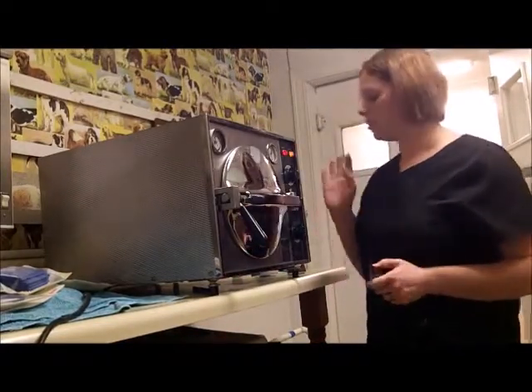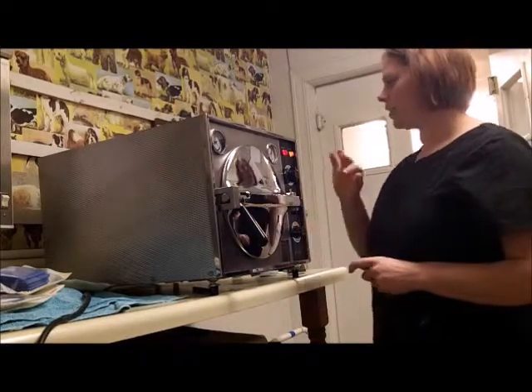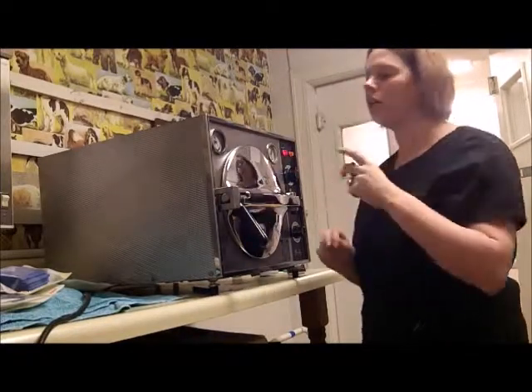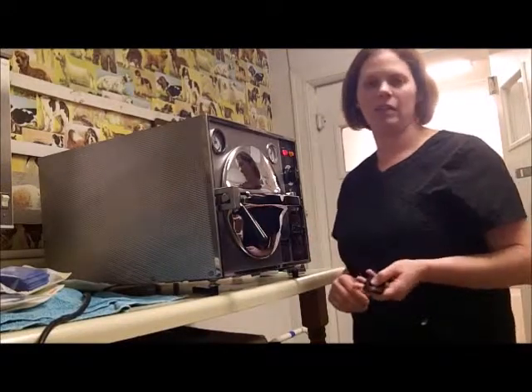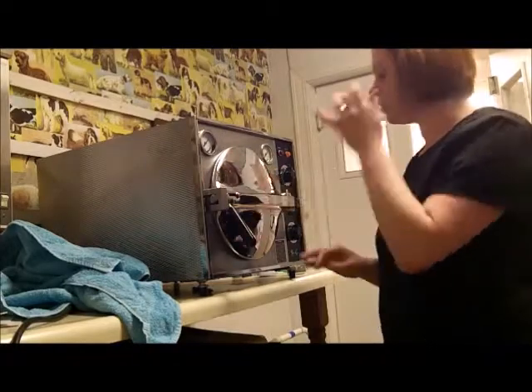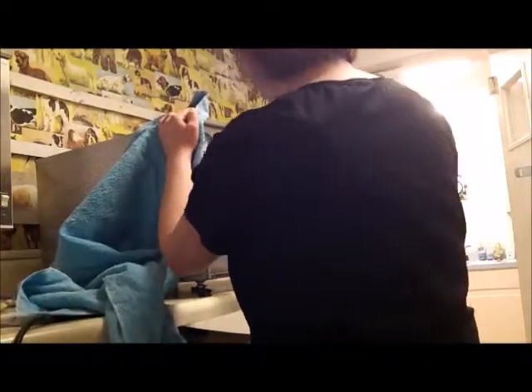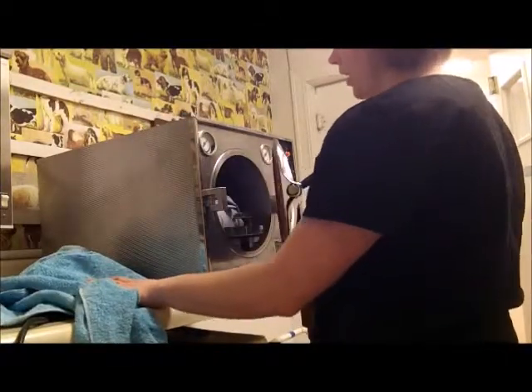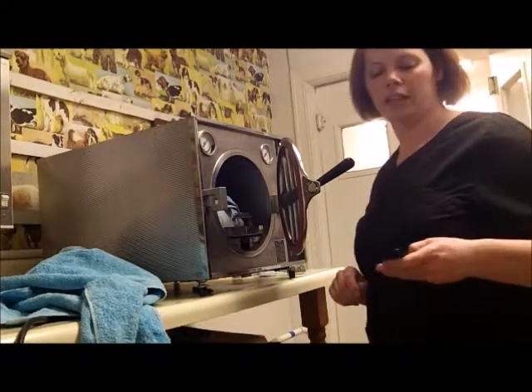We have now sterilized for 20 minutes, so we're going to turn from sterilize to vent. We're going to let this vent until the pressure is released and back to zero, and then we will open the door and let it dry for about 15 minutes. The venting has taken place. The pressure is now at zero, so we're going to open the door to allow the temperature to go back down, and for venting and drying. And then we'll confirm that everything has been sterilized properly by checking the external indicators.